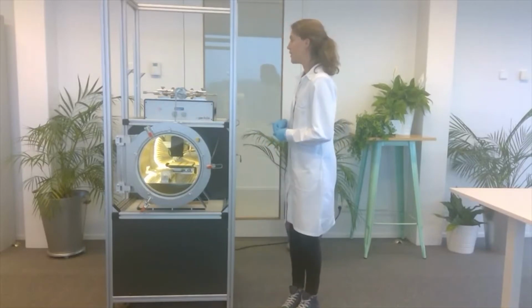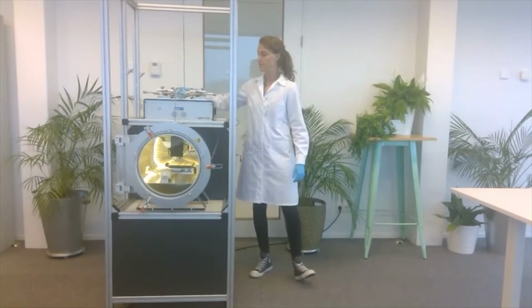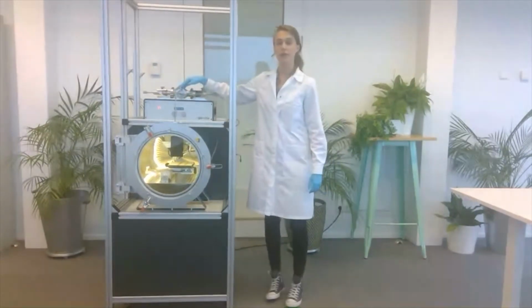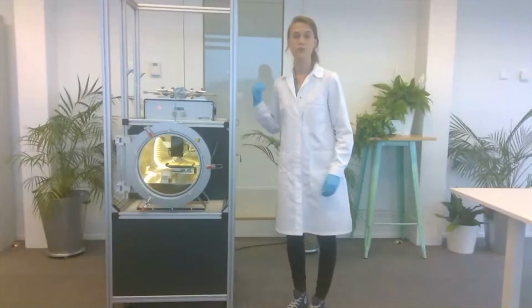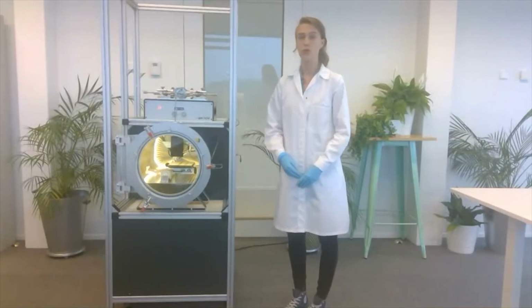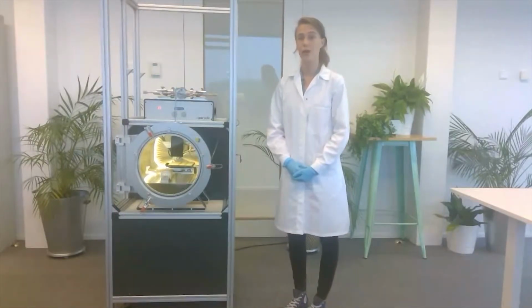On the back of the true flow piece, I can attach the carrier gas inlet. And on the front, where we have the nano aerosol outlet, we can attach it to the tubing of the printer. So our aerosol will flow into the vacuum chamber where it will be impacted on your substrate. Later on, I will show how to place substrates and print patterns. First, I will hand you back over to Pauline, who will tell some more about the printer.